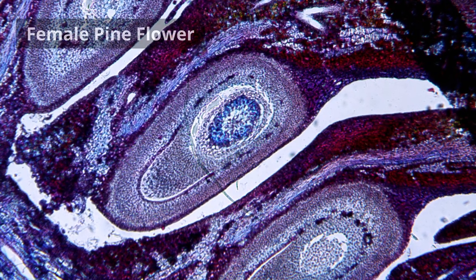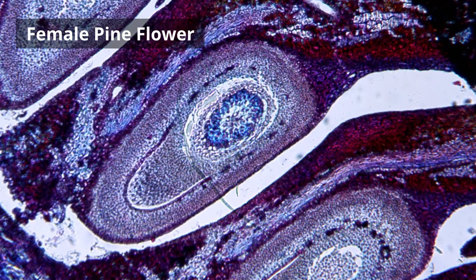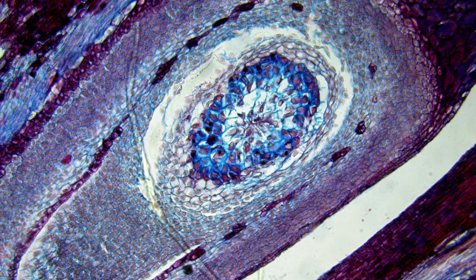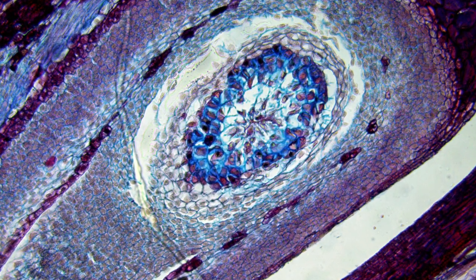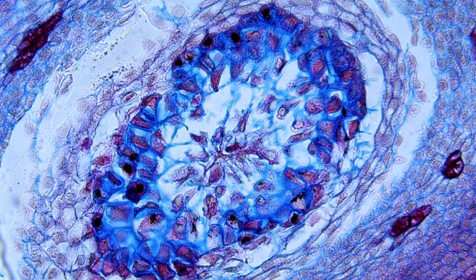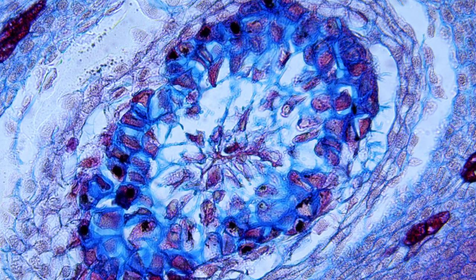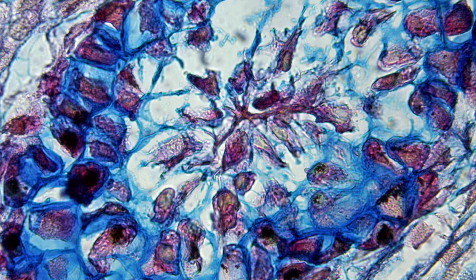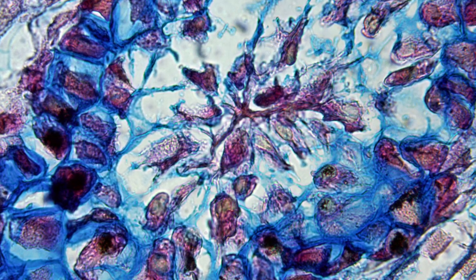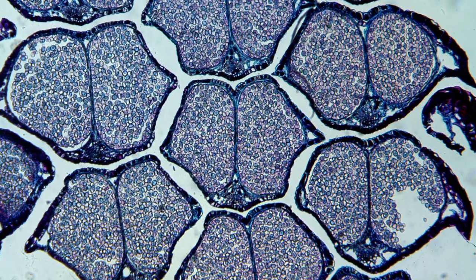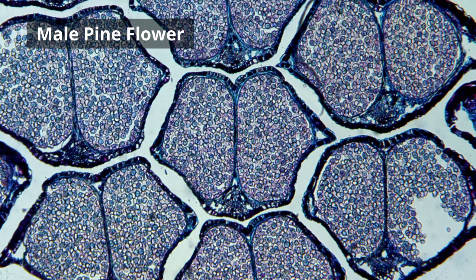So now it's finally time to put a few specimens under the microscope. You can already see the first one here. This is a tardigrade which I found in one of my moss samples. It's also known as a water bear or a moss piglet. And I'm also going to show you a couple of other permanent slides. I've already made commercial permanent slides because they also look extremely beautiful. Now I did already mention that this particular microscope model comes equipped with plan semi-apochromatic objectives. This ensures that the image is crisp and sharp all the way into the corners. And the semi-apochromatic objectives also ensure that the color reproduction is of very high quality because chromatic aberrations are kept to a minimum. And both of these factors are of course very important if you're interested in doing a lot of photography work with the microscope.